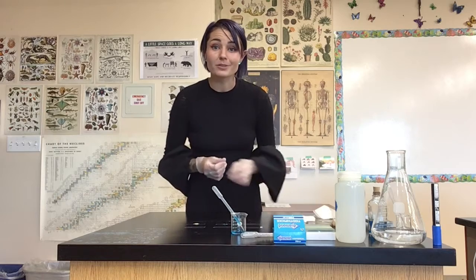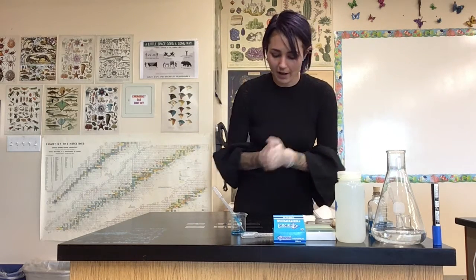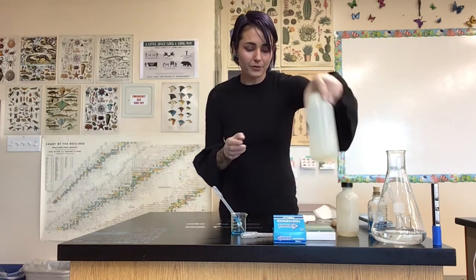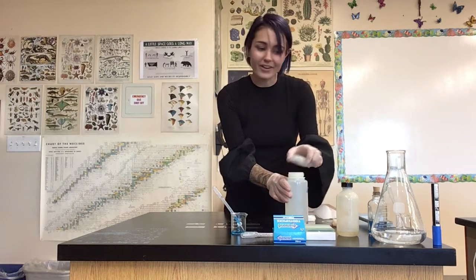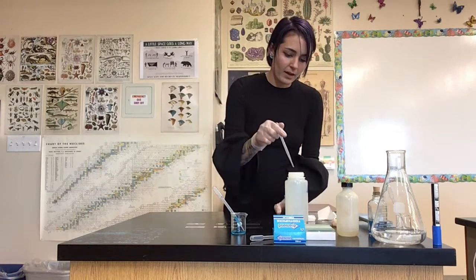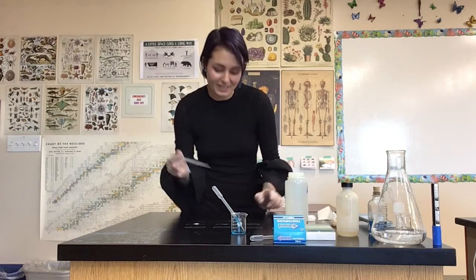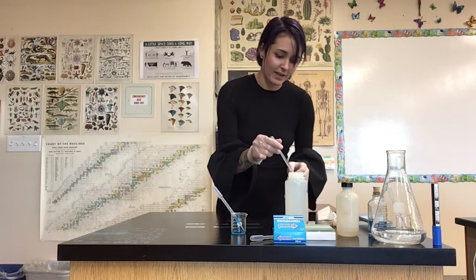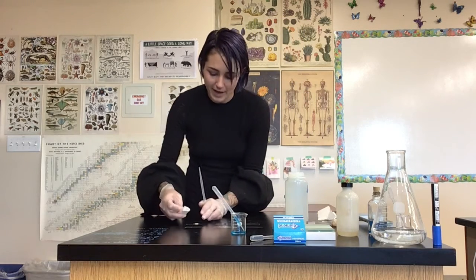That's how we were able to do the chromatography lab. Now that I have all of the hydrogen chloride soaked up, what I'm going to do is take another pipette. I know, lots of pipettes, and we've got to make sure that they're all clean. I'm going to get some deionized water. Essentially, this means that it doesn't have any ions in it that might otherwise interact with the other substances that we have at work here.